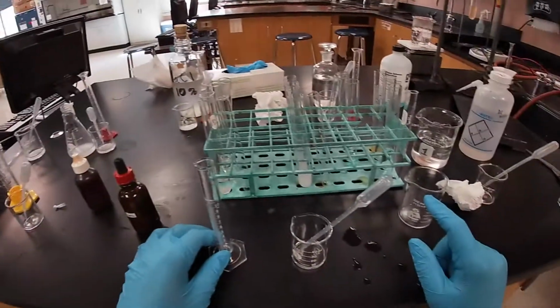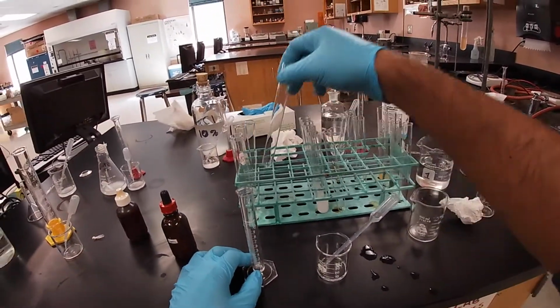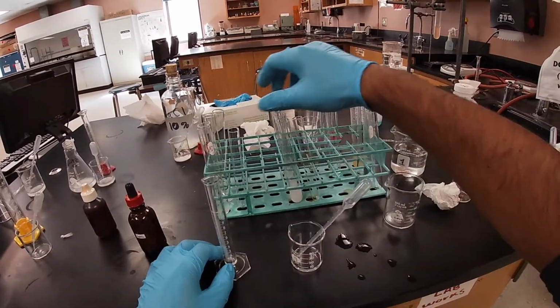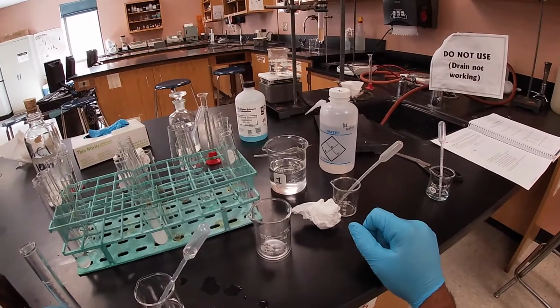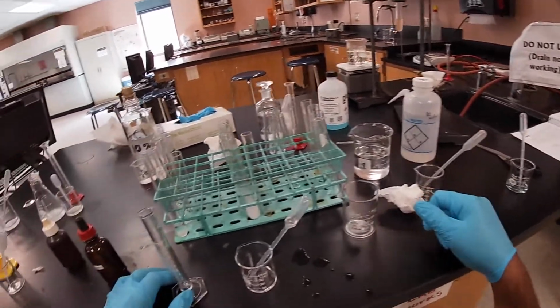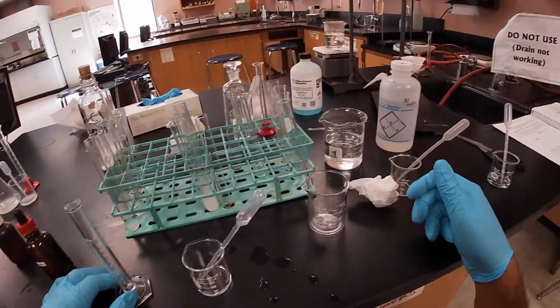So we're going to distribute only 2 milliliters to each of these test tubes. I got some smaller test tubes, and we're gonna do the same test. And then there probably is some leftover content, but it is a white filter, so it'll be a little difficult to identify until it actually dries.